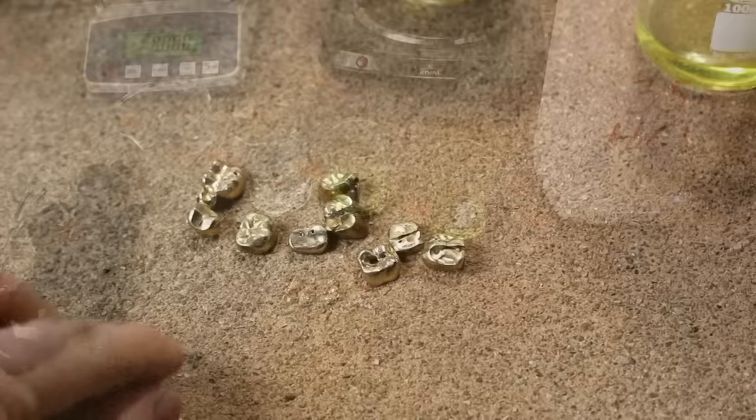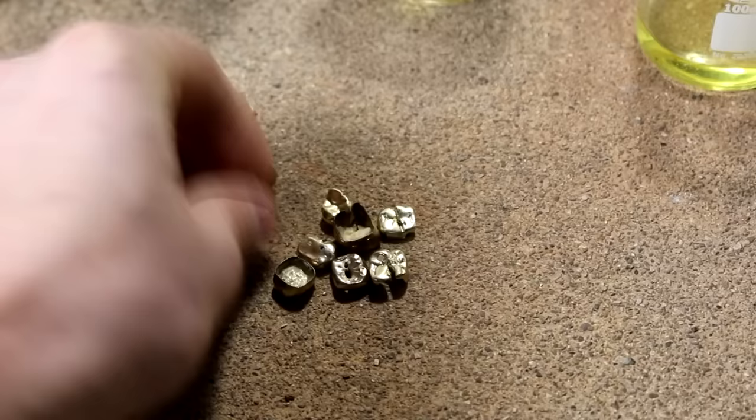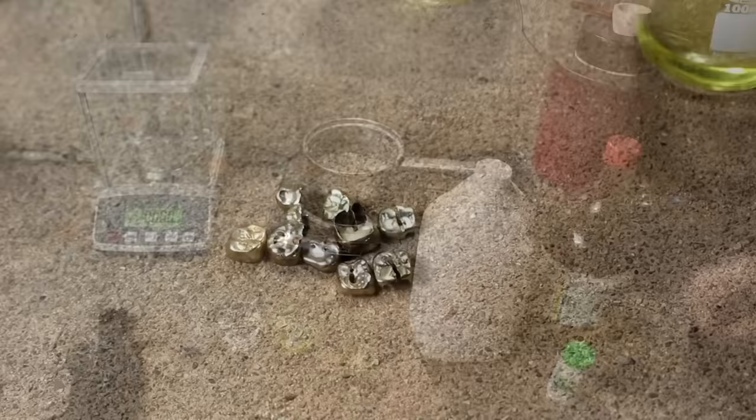These are some gold crowns that were taken out of actual people's mouths. As you can see, this crown used to go on top of a molar, and they've been removed — now they are scrap gold. It should be around 18 carats, and is mixed with various other metals to make it harder. Today I'm going to be processing it down and separating those metals so that this is a pure gold bullion.